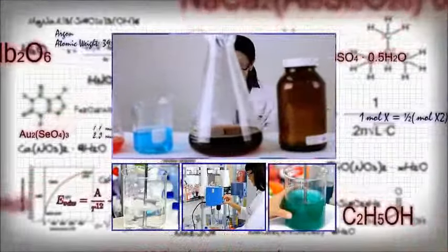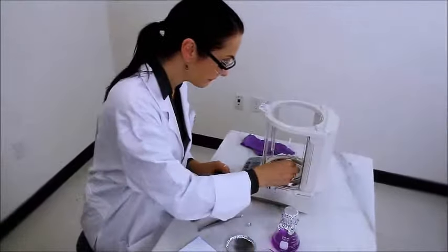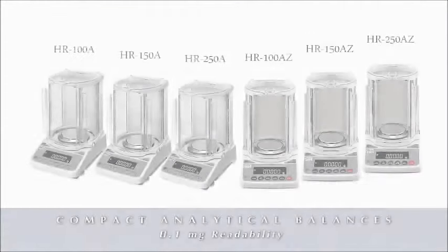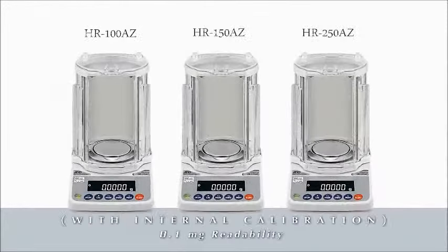Every lab needs a reliable balance. That's why you should get to know the new HRA series of compact analytical balances from A&D. Six models are available in three capacities, all with 0.1 milligram readability. The HRA-Z models include internal calibration.